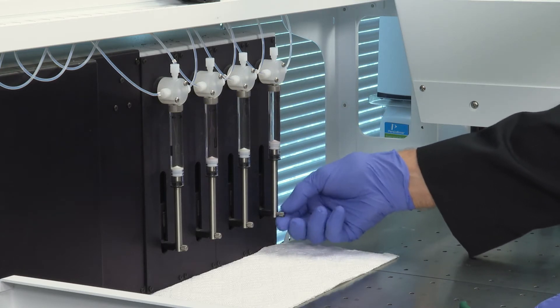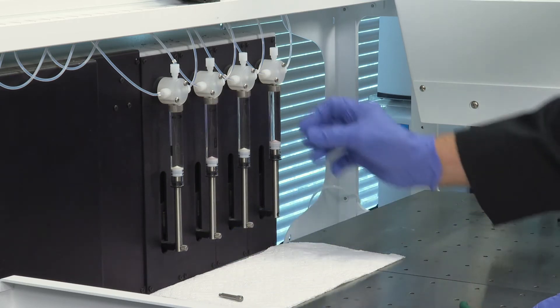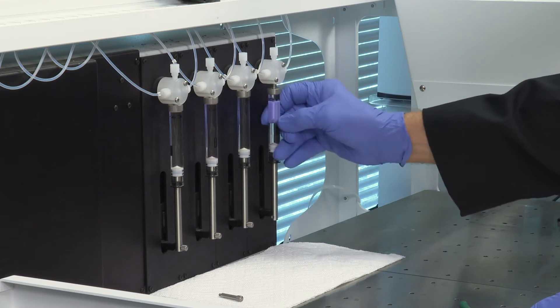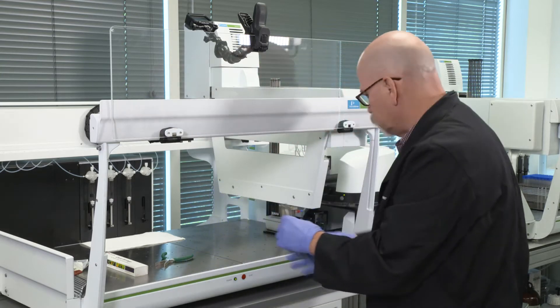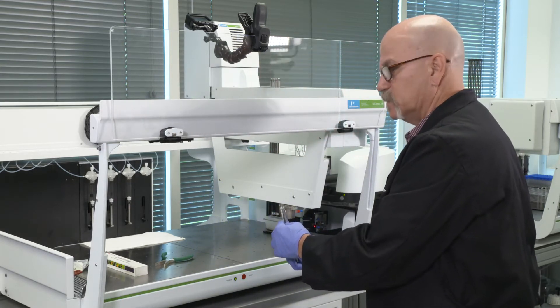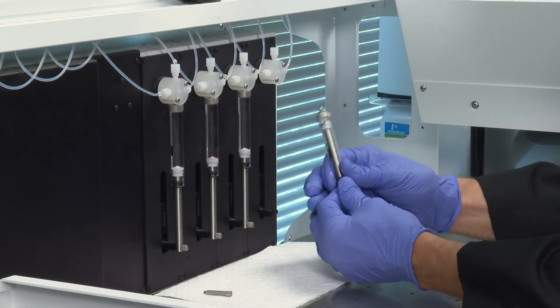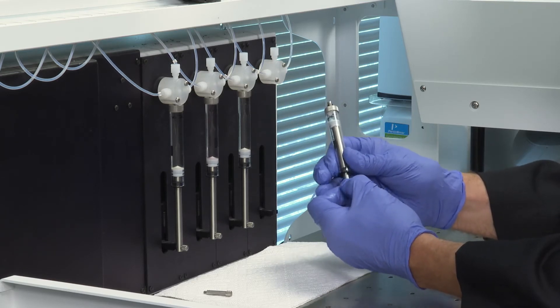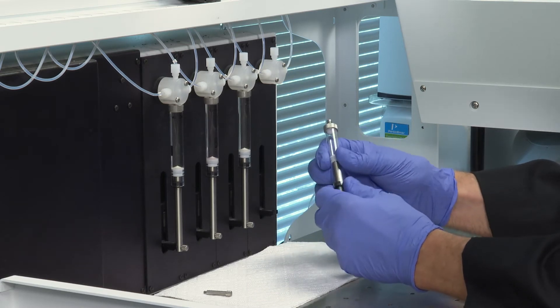Remove the screw — the shoulder screw that drives the syringe shaft — and lay it aside. Finish unscrewing the syringe, then move it to a waste container to properly dispose of the heptane. Feel the syringe plunger: if it feels stiff, it's still making good contact. If it's very loose, you'll need to replace it.